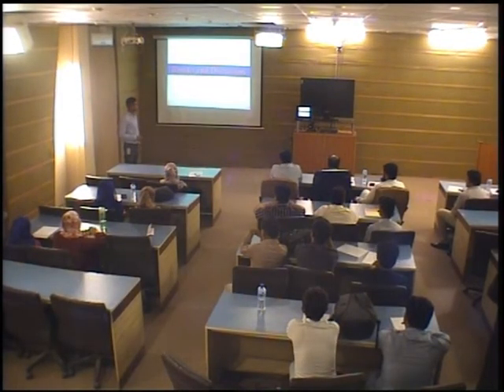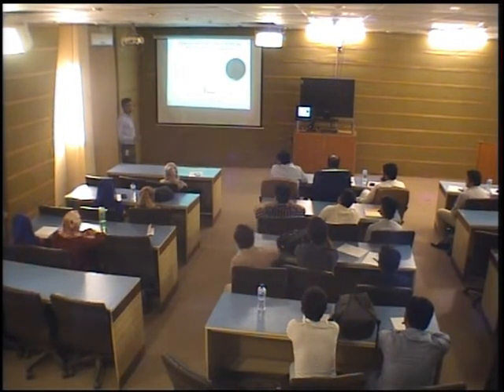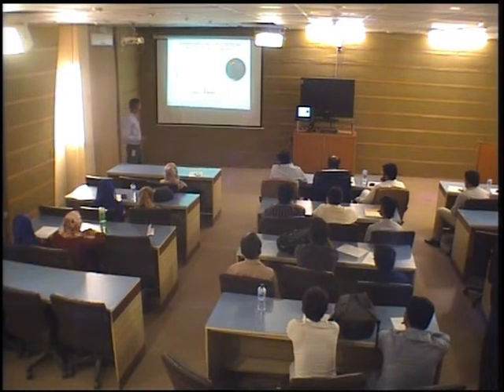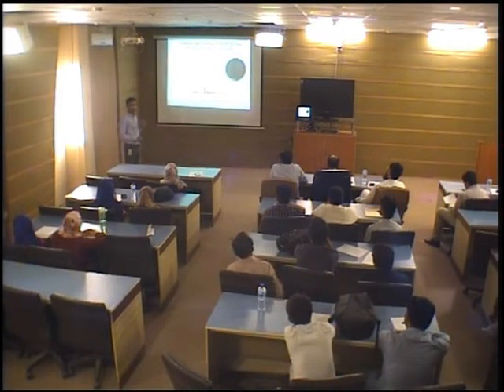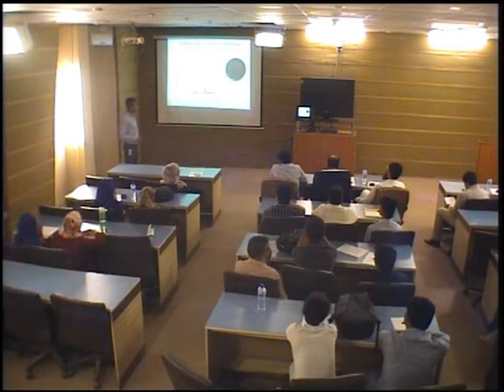Results and discussion. In the first set of experiments, we have chosen the emission spectrum of kohal, basically Hashmi Surma, produced by a 532 nanometer laser. This is our target material, and the spots you can easily see here are basically laser spots. We have taken multiple data, and finally we get average data to reduce the fluctuation or noise. This whole spectrum ranges from 200 to 720 nanometer. And finally, we will analyze this spectrum.